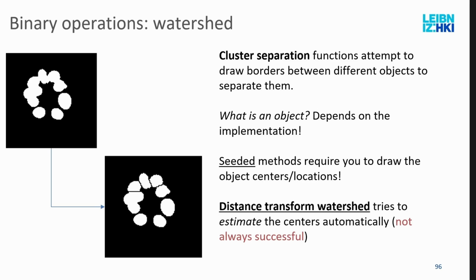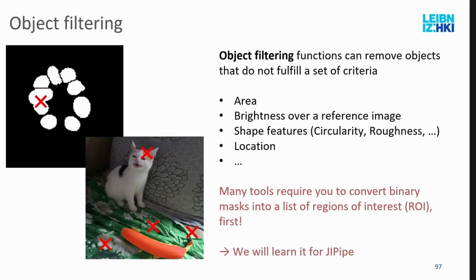And then this one here, we usually have to filter out with some additional object filtering to not disturb your statistics. Object filtering is extremely tool specific. ImageJ has its own tooling, Imaris has its own tooling, and Python also has tooling, but it calls it differently.